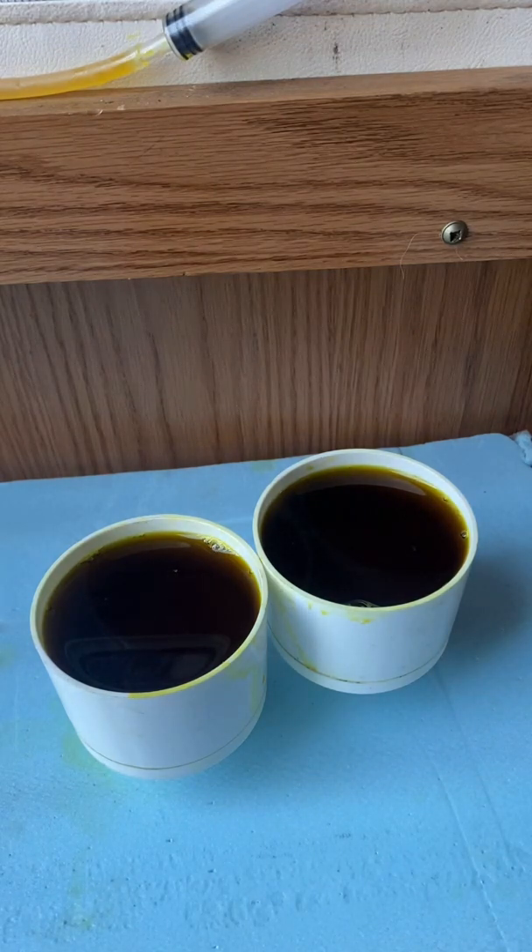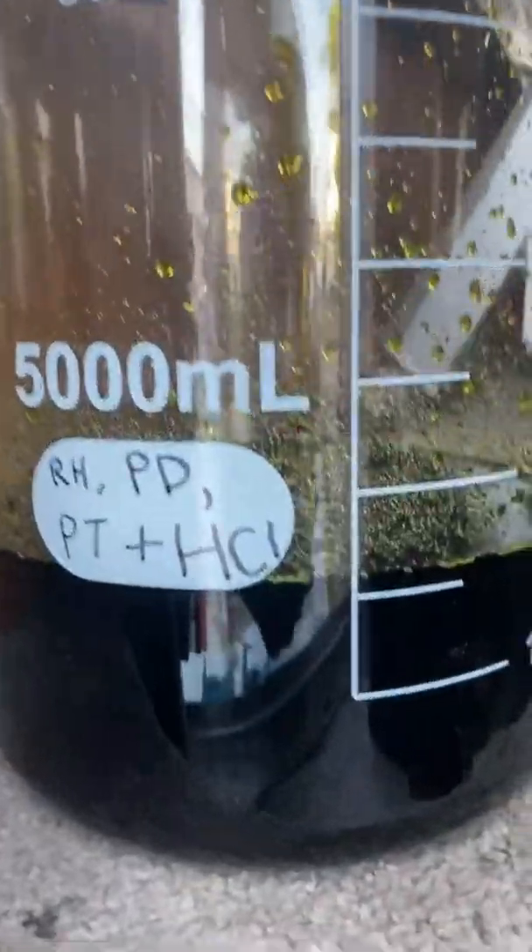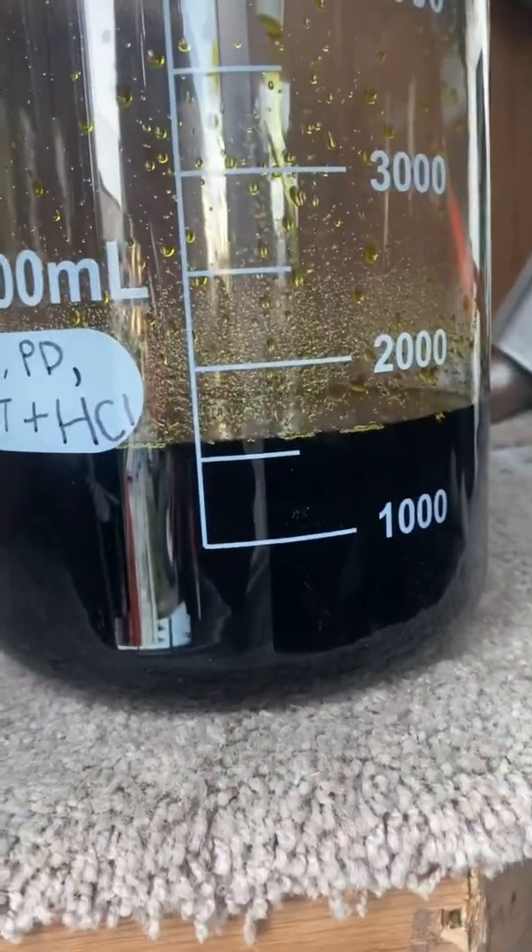I think we're about — man, we're almost halfway. See, there's still all that at the bottom. I don't know if you can see that gray substance in there at the bottom. There it is. That had settled through, but hopefully that's not — that can't be platinum. That's just stuff that got through the pressure process on our first going around.